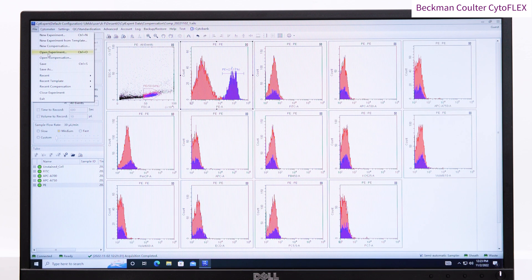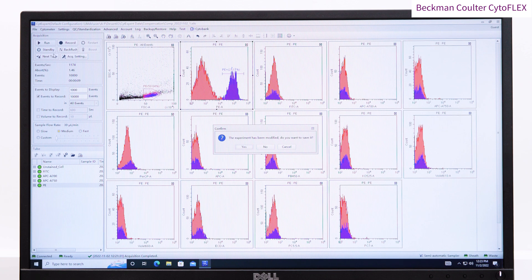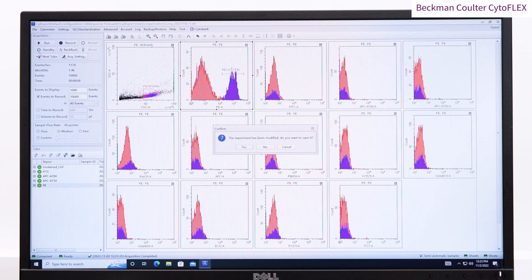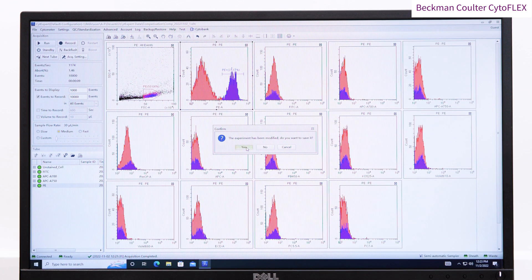We are now ready to go back to our stained sample by pressing Open Experiment and save the compensation experiment when prompted.